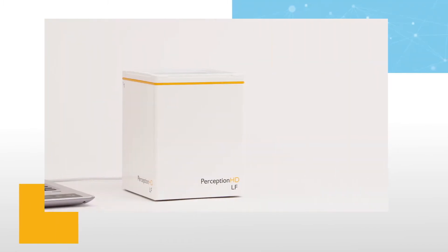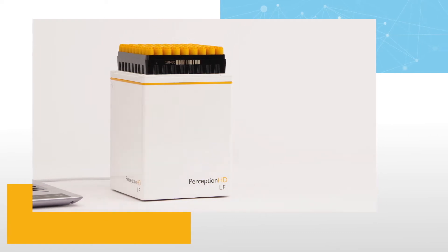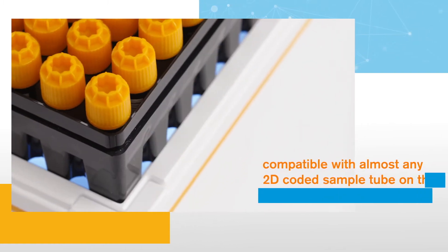This surprisingly compact reader delivers a wealth of benefits in almost no time at all. With its 18-megapixel camera, the reader is compatible with almost any 2D-coded sample tube on the market, including Fluid X tubes.